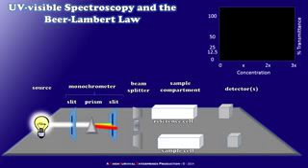Only one wavelength of light in this situation is going to make it through the second slit in my monochromator, striking the beam splitter and becoming two beams of equal intensity. These two beams will traverse a cell, a different one for each of course, one being the reference and one being the sample cell. As the beam exits these cells, it strikes the detectors, which are firing away, creating an electrical current. And you'll notice at the moment that the intensity of the light exiting both the reference and sample cells is identical. Therefore, the current generated by each detector is identical.